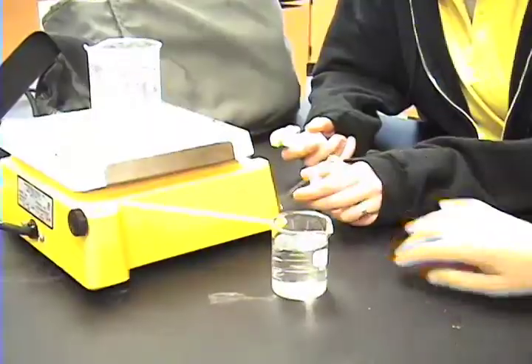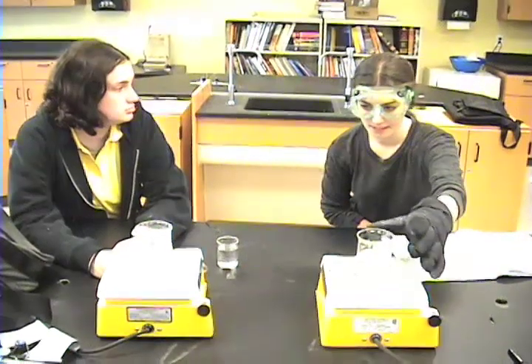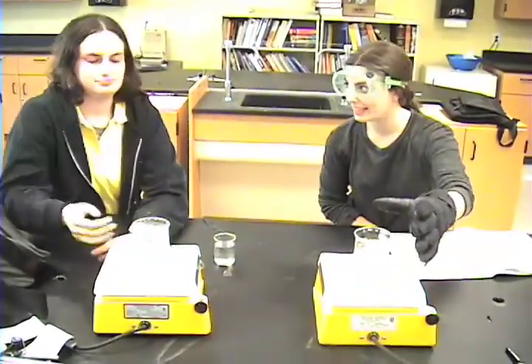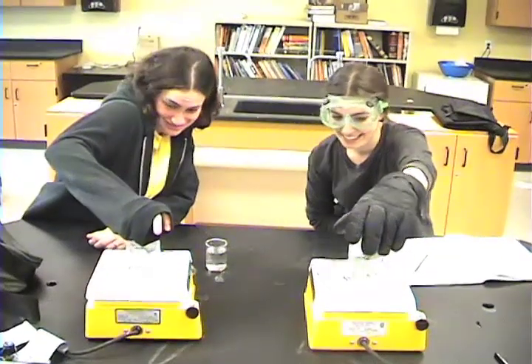The water is only supposed to reach a simmer. Turn the heat off when you're done. Hannah does not know what's going on. Hannah doesn't have any safety equipment on — this is dangerous. Hannah's sleeves are also a hazard and she is warned repeatedly, responding with 'whatever.'